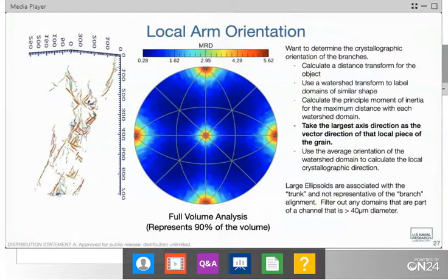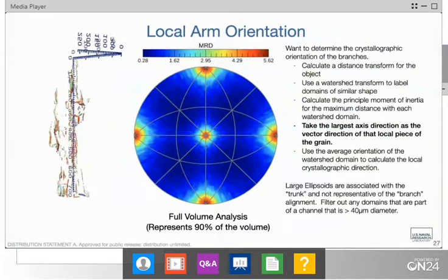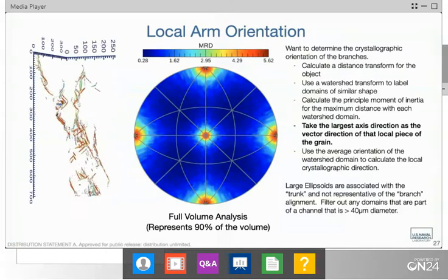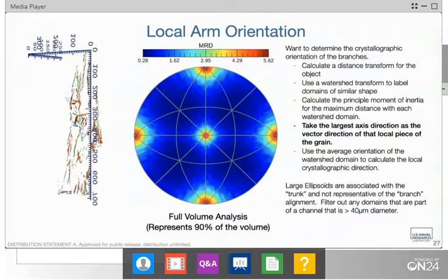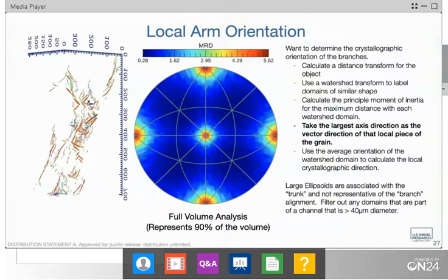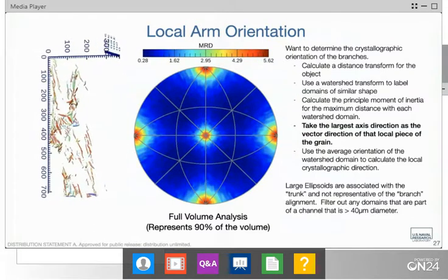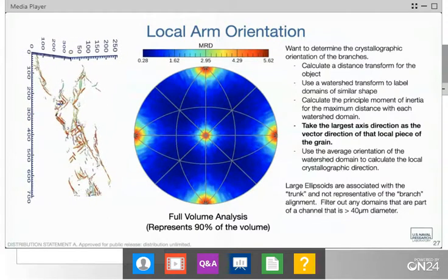Some of it is going back. I've seen some people back-calculating the equivalent Hall-Petch size and asking whether it matches any of the microstructural elements we see. One thing I didn't talk about was the segregation that forms during this. There are cellular structures that form on the sub-micron level, and some work has shown that's actually the most appropriate length scale. You did see a lot of sub-grains within the EBSD maps, and again, that may be the most appropriate grain size for describing the structure in terms of a Hall-Petch relationship.